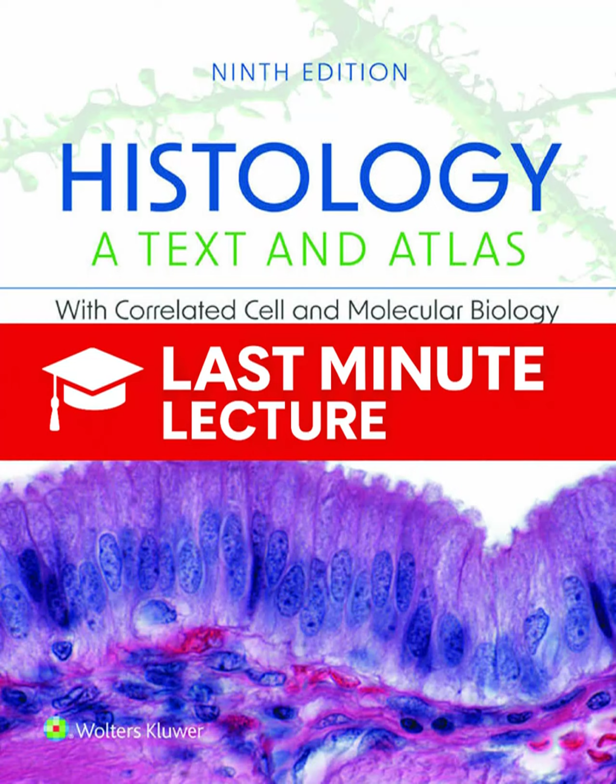So what we've covered today is really a comprehensive methodological evolution. We started with the basic necessity of fixing tissue with formalin, relying on simple acid-base chemistry to get the contrast of an H&E stain. And from there, we moved into highly specific localization tools like PAS and Feulgen, and then the immense specificity of the antigen-antibody reaction in immunocytochemistry. Exactly. And we completed our journey in the 21st century, moving from molecular localization with FISH to the computational imaging revolution, the tools that deal with the physical barriers of light, like confocal and super resolution.